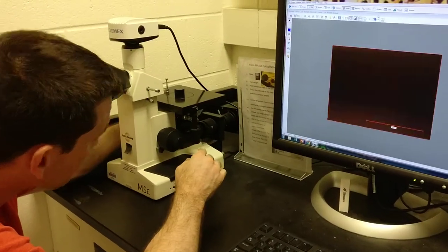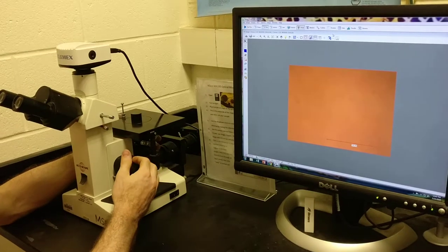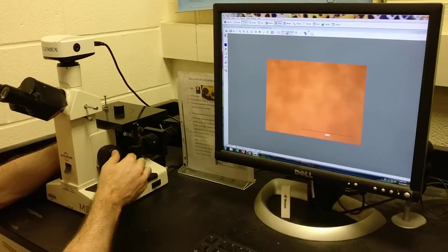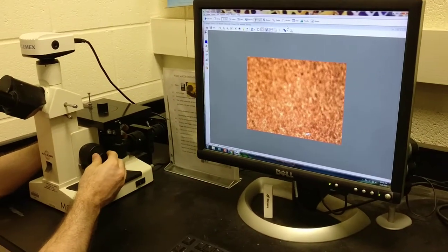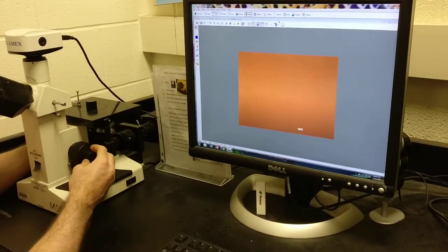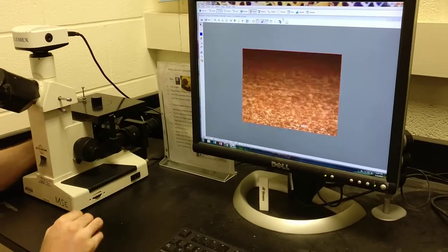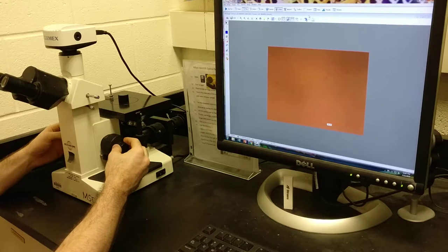So we're going to rotate this clockwise and scroll our fine focus forward until we can see the structure again. We're going to go up another magnification, do it again. And I think there's one more.